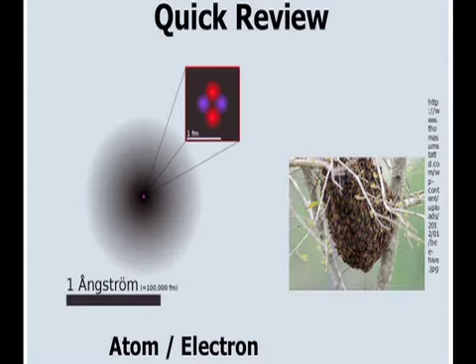Now my area is electron microscopy. So basically, we'll talk about the microscope, same way as the light microscope, but instead of using light, we'll be using electrons. So quick review, if you remember, this is a representation of the atom. You divide the material all the way to these little particles that have a nucleus and a cloud of electrons flying around. It's basically very much like a beehive with all the bees outside there.